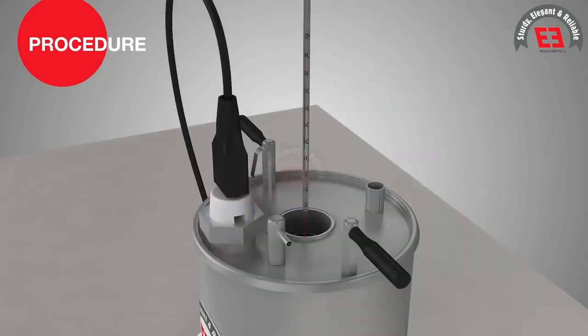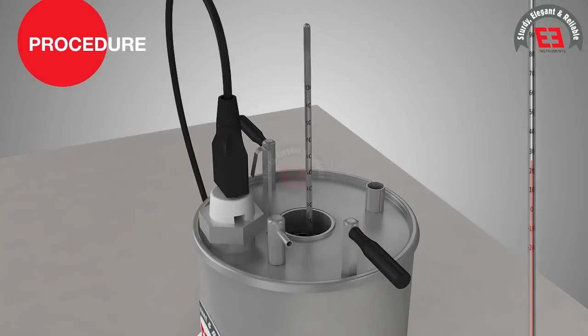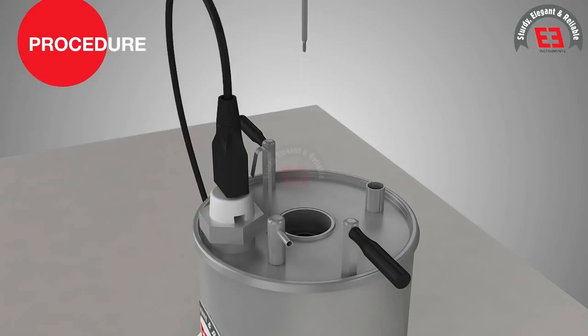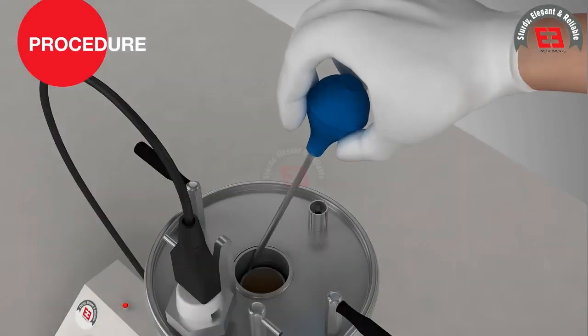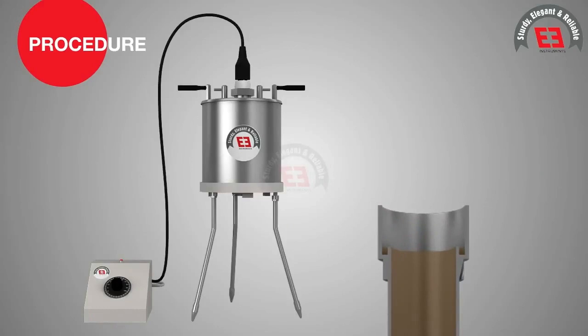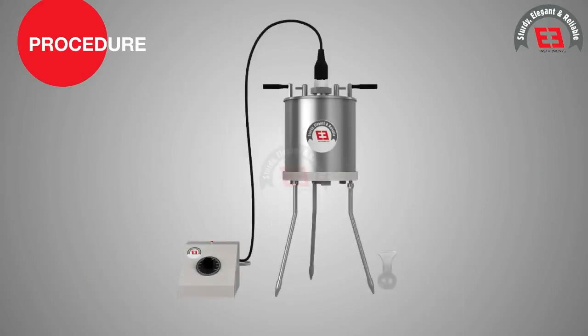The sample in the tube is stirred continuously with the thermometer. As soon as required temperature is attained and stabilized to 0.02 degrees Celsius for more than a minute, withdraw the oil tube thermometer and remove the surplus liquid quickly with withdrawal tube so that the level of the material in the gallery is below the level in the oil tube. Receiving flask is placed in a position under the outlet of the oil tube.